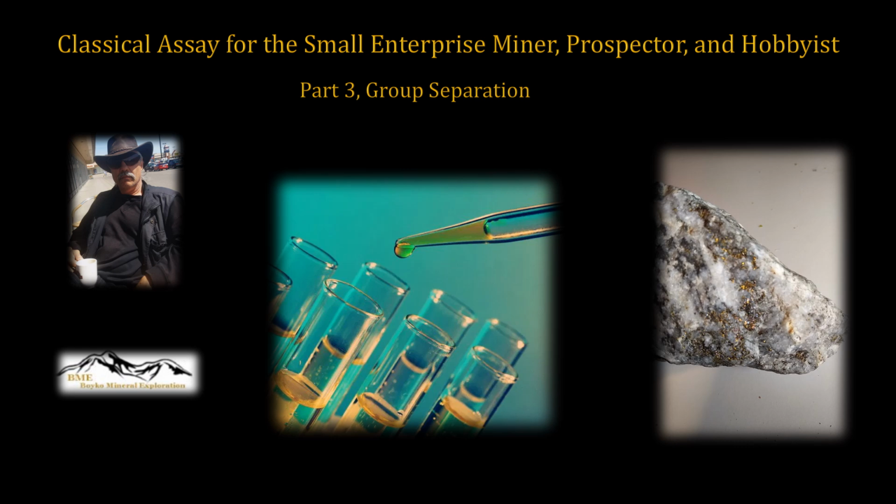In part 2, I introduced the groups and their associated elements and mentioned the four principles, being the solubility product, acid-base reactions, redox reactions and buffers, as well as the common ion effect. In this presentation, I will be discussing sample preparation, the separation flowchart, and try to explain without detail some of the chemical reactions, all of which will be elaborated on in future presentations within this series.